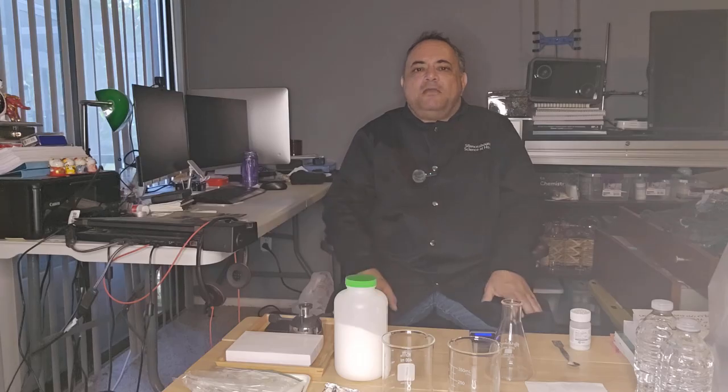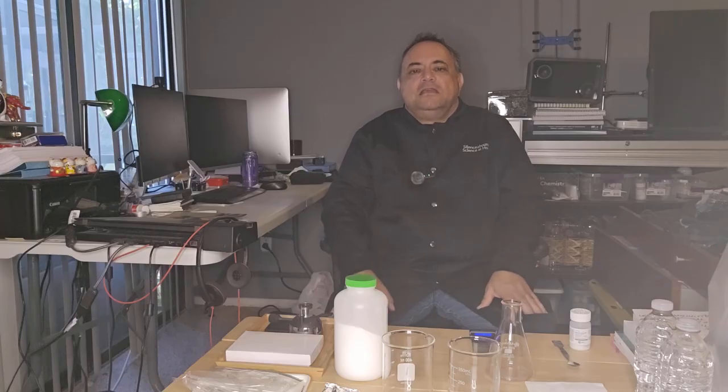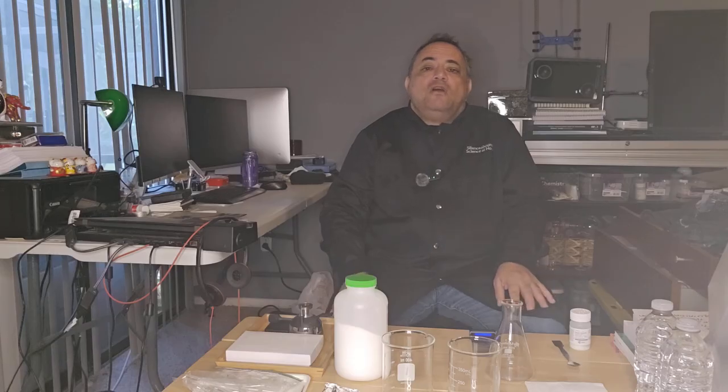In today's experiment, we're going to be looking at the chemical traffic signal reaction. This is a very popular reaction, and I'm sure you've seen it already on YouTube and Instagram, people performing the chemical traffic signal experiment. The reason why it's cool, very unique, and demonstrates a lot of important chemical redox reactions. And so it's a very fundamentally important reaction that everyone needs to learn about.